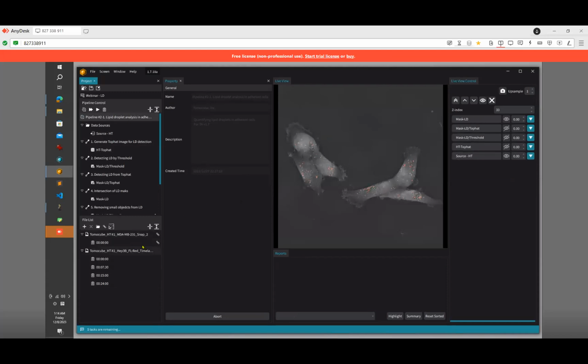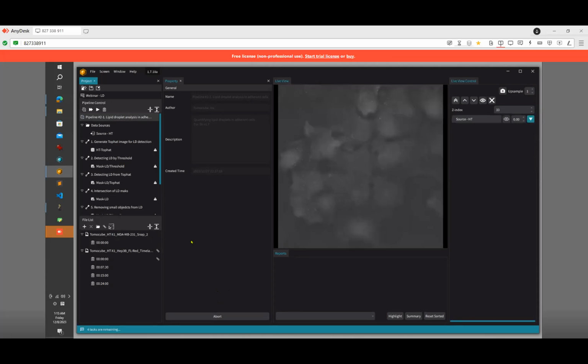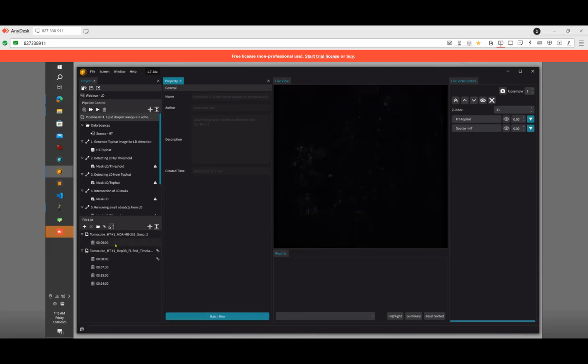So after finishing the first data set, I would like to abort in the middle to see the results. So let's abort. You can abort and resume afterwards. And it takes some time to finish the process.